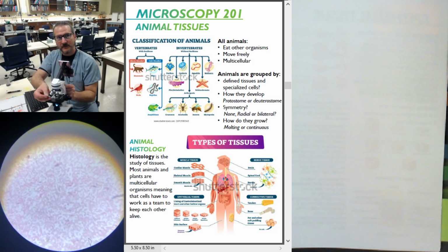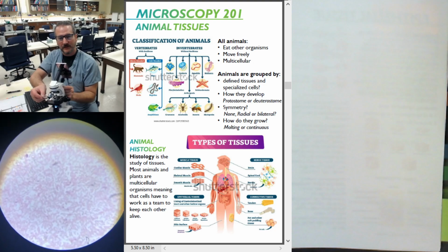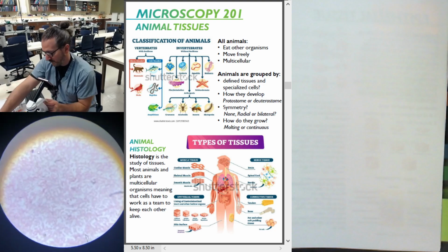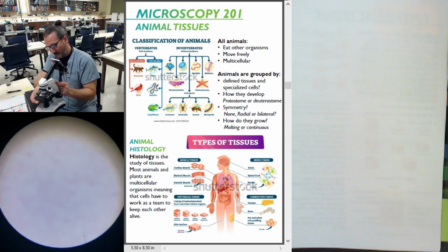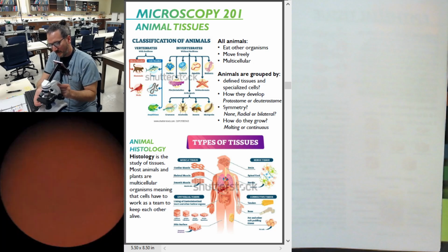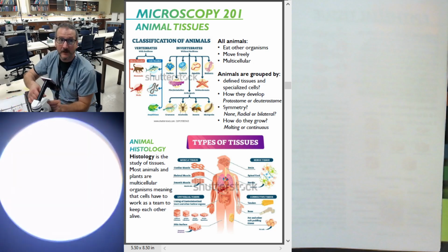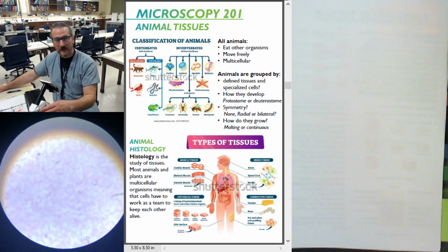I'm just going to swipe it towards me a couple times, see if that helps at all. So while I'm in here, I may as well wipe the iris. Alright, let's see if we can go back.